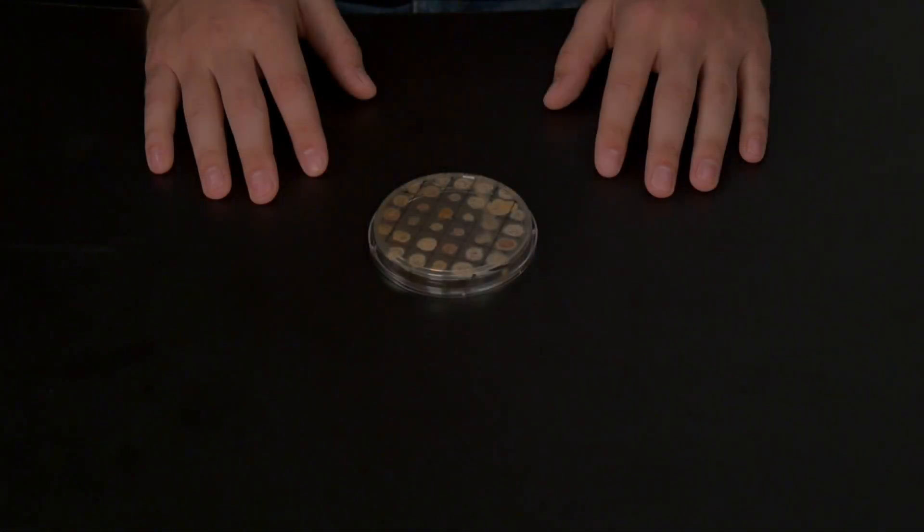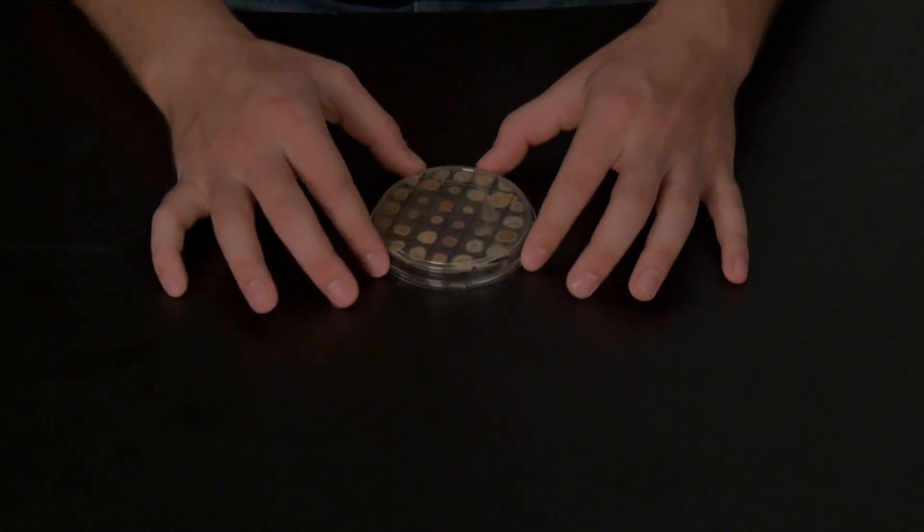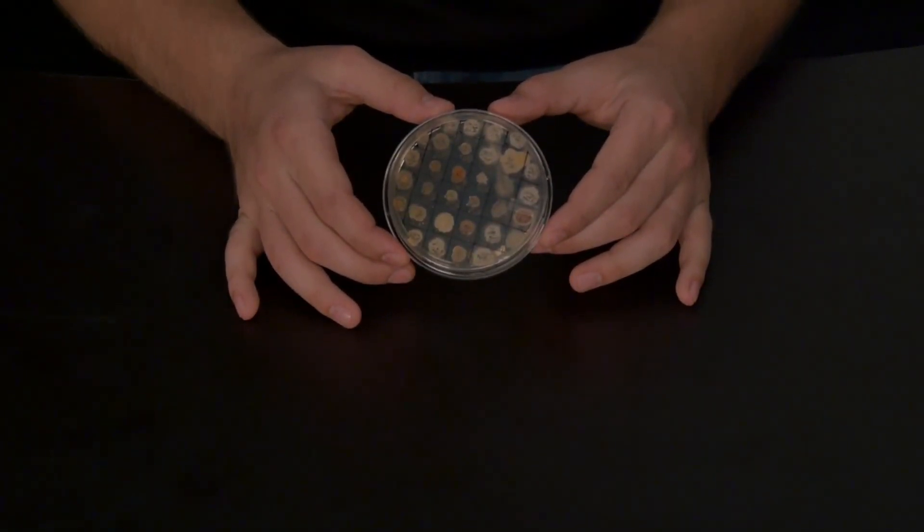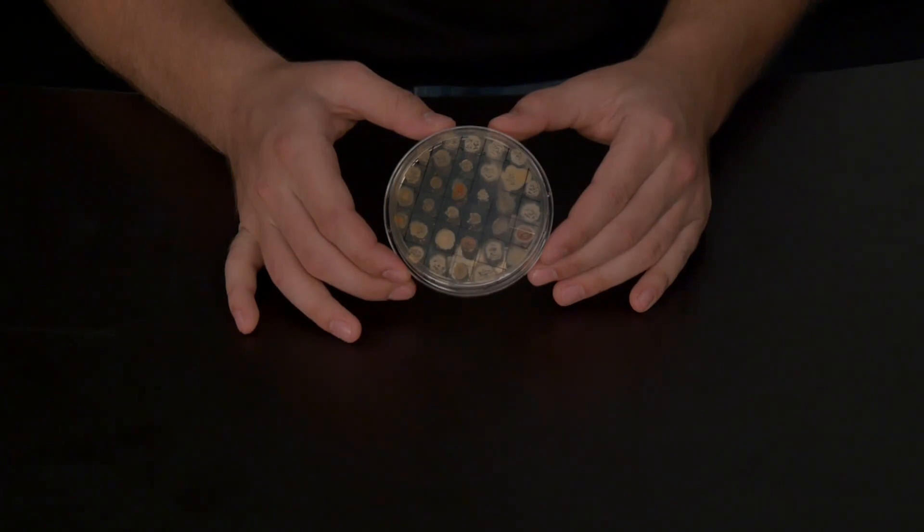Once we have completed our serial dilutions of bacteria, we will now organize them into rows and columns on a new petri dish. We have named this technique patch plating.